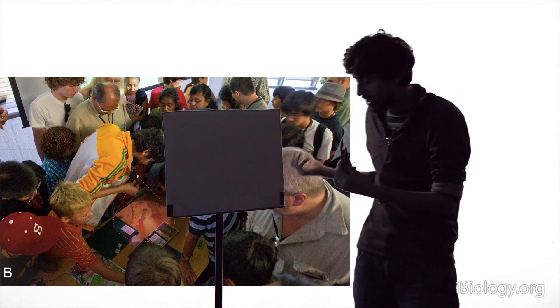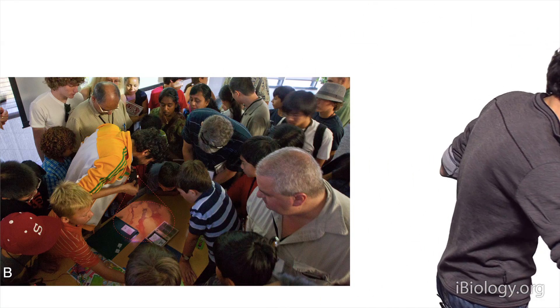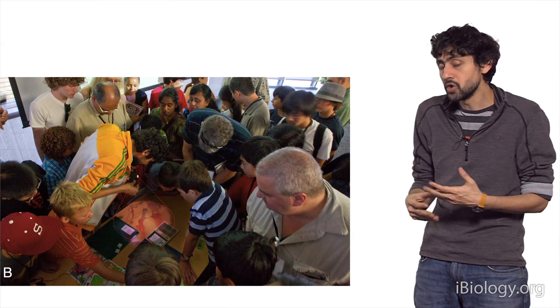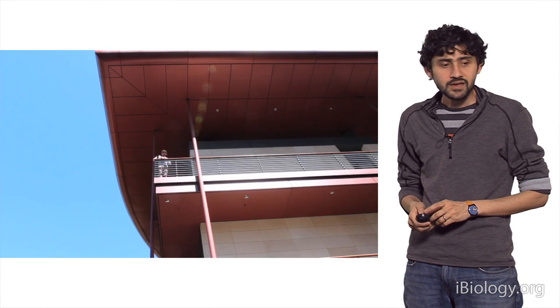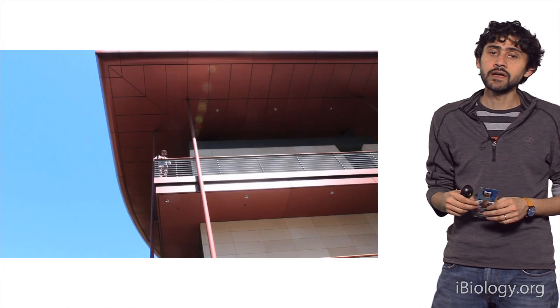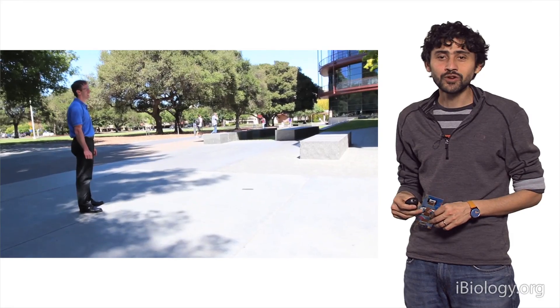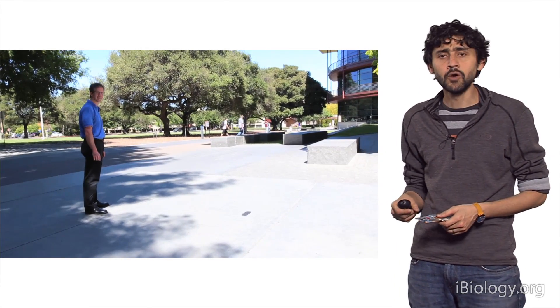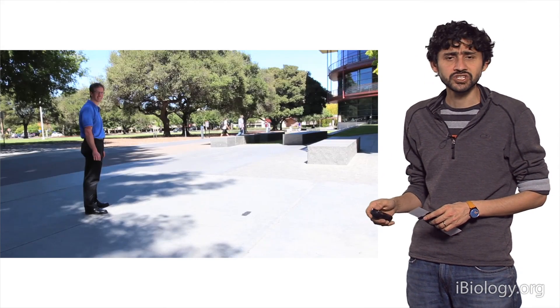What's fascinating about the projection instrument is that multiple people can share images simultaneously and have a conversation about what they're seeing in a live demo. Projection microscopes are very useful because they allow us to train microscopists out in the field on remote diagnostics. For field instruments it's important that they be rugged — we joked we would throw them, and indeed they survive several stories of a fall. They are truly designed for field conditions.